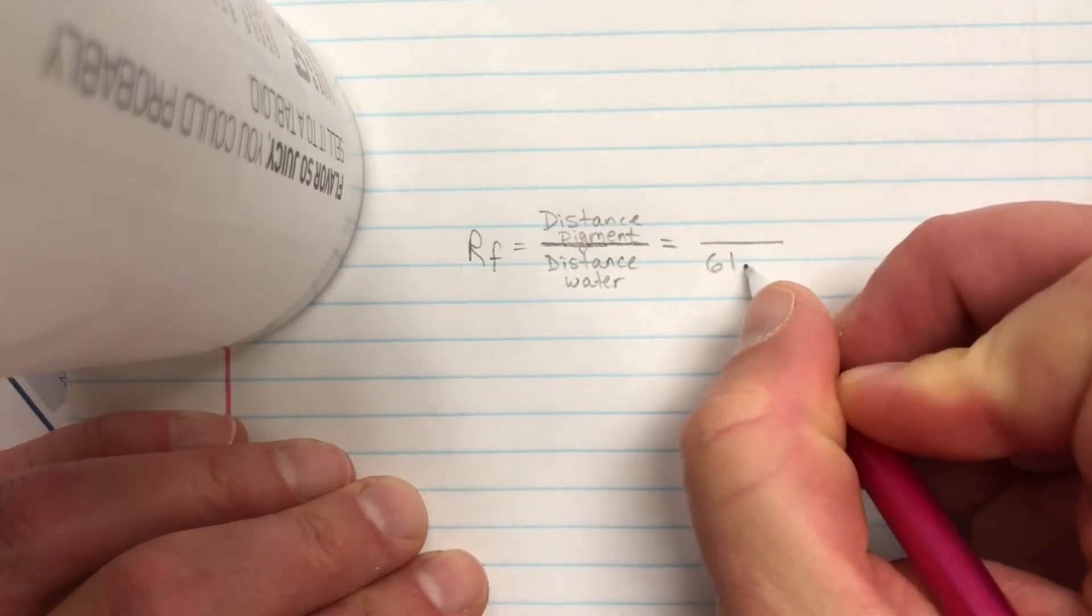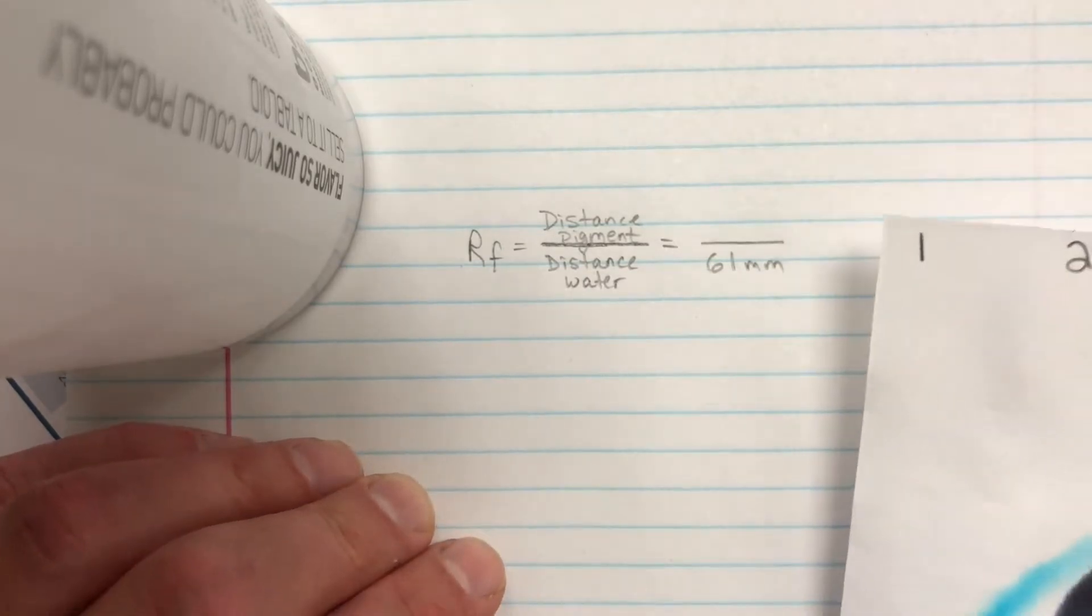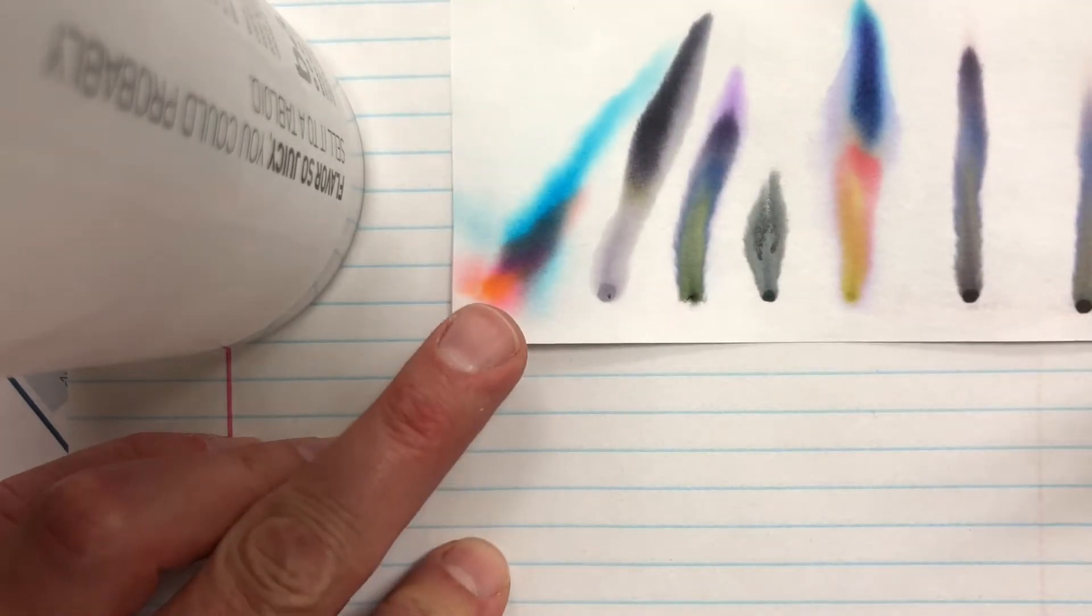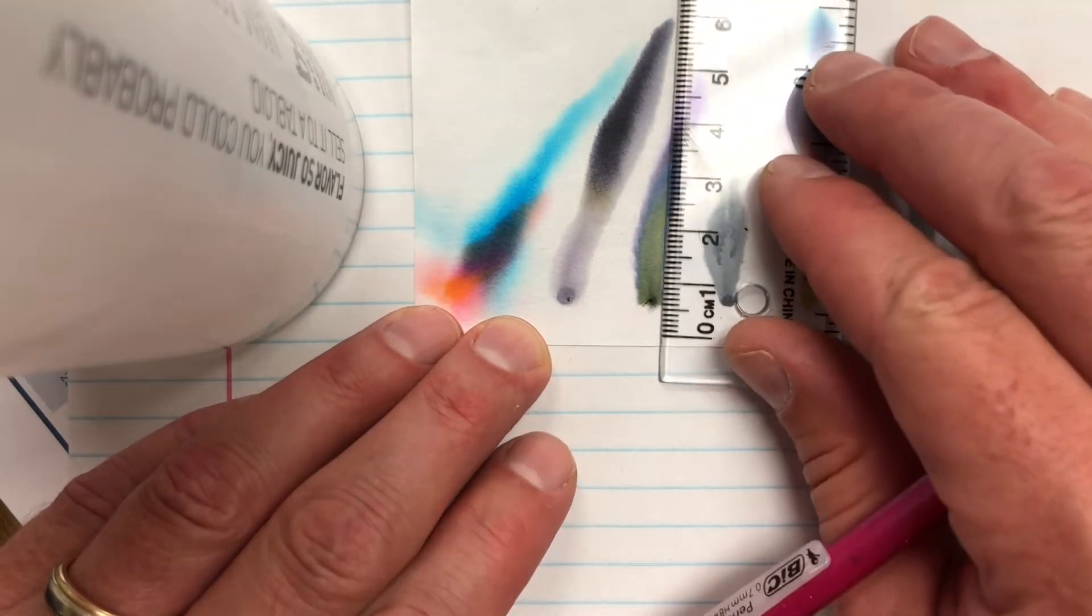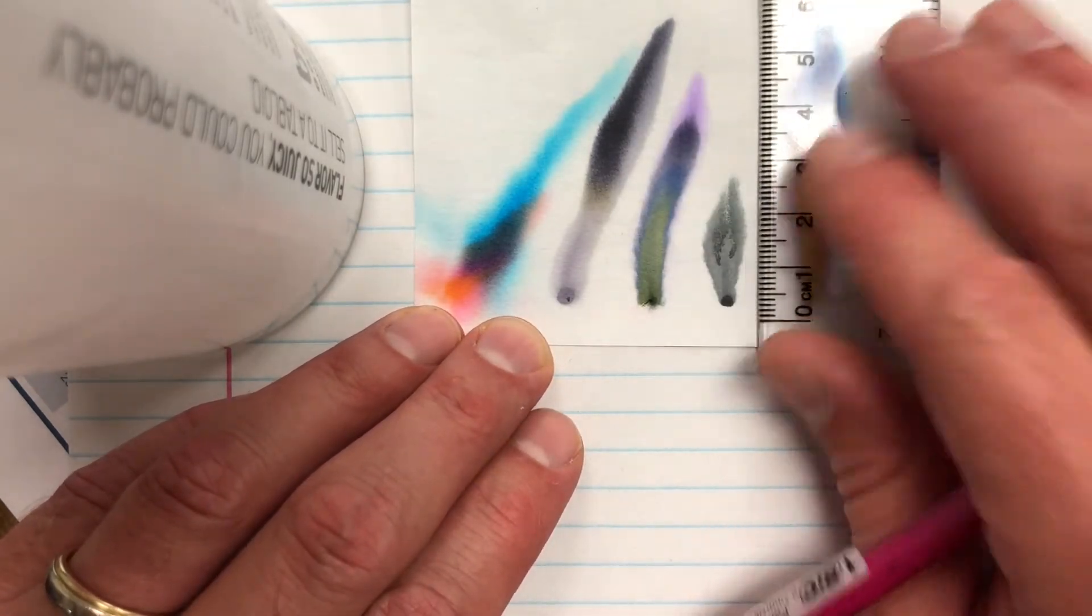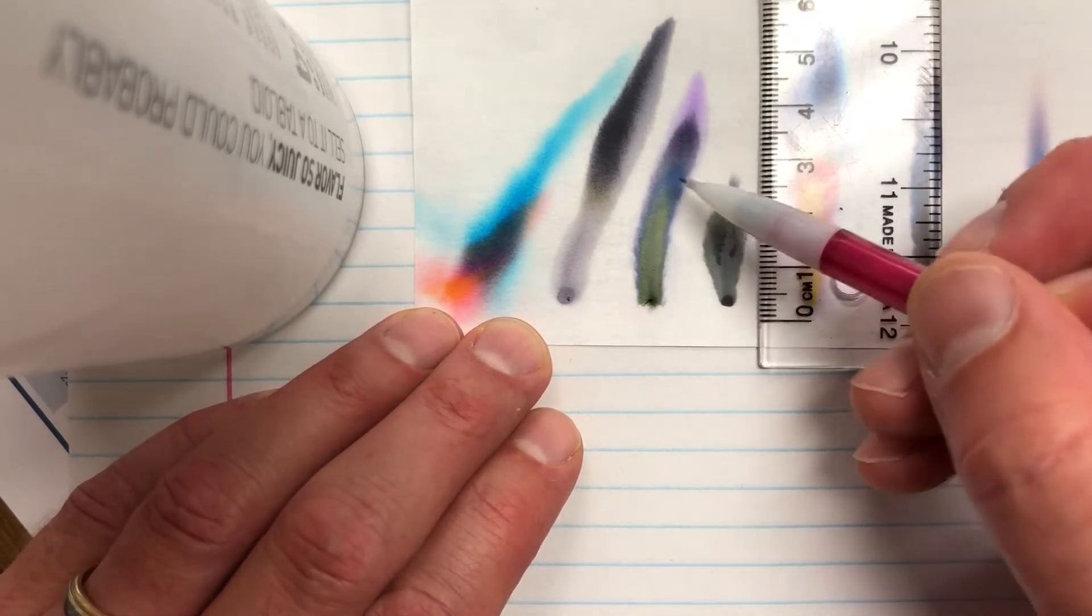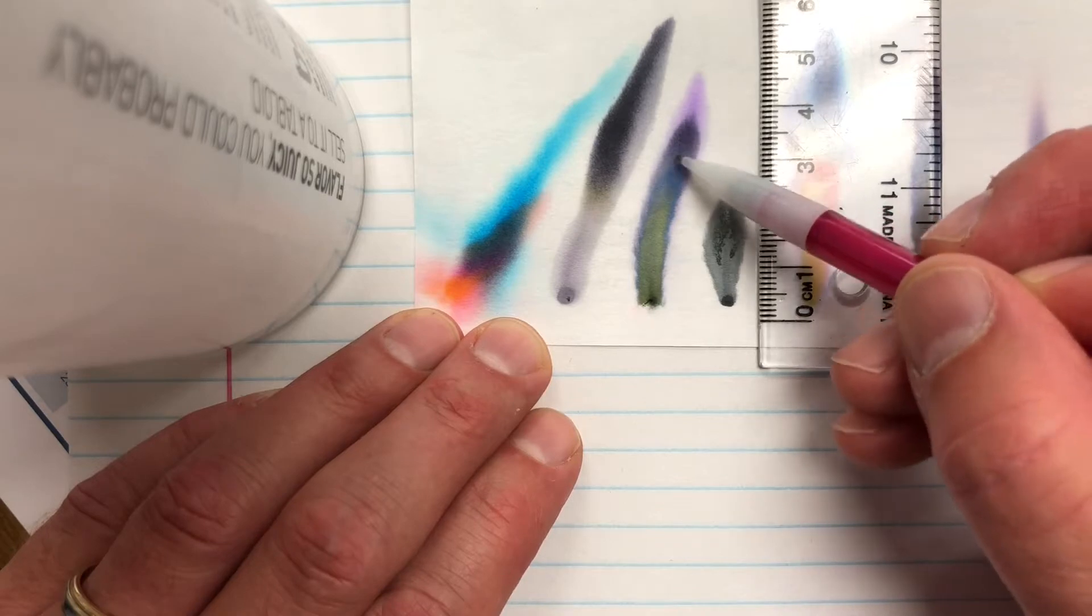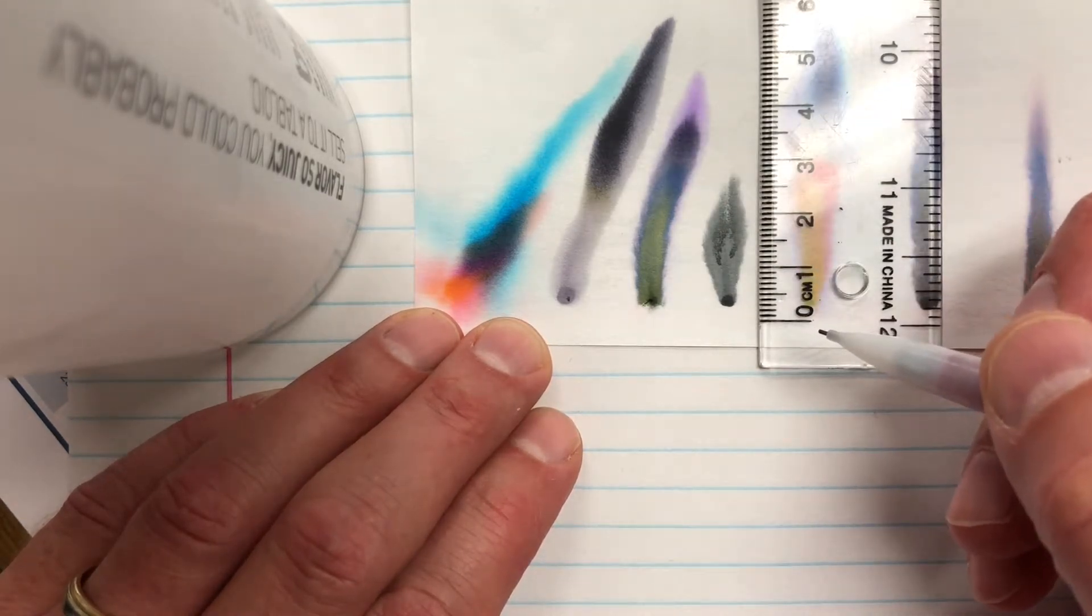And I'm going to go and figure out what the very first color RF value is. So if I look, you'll see I see three, actually four colors: I see a yellow, a blue, a dark purple, and a light purple. So I have four colors that I'm going to find RF values for.